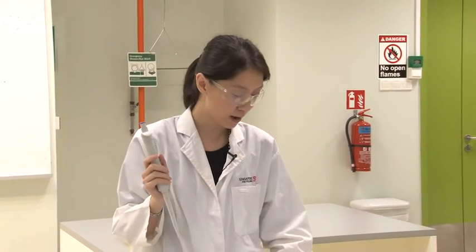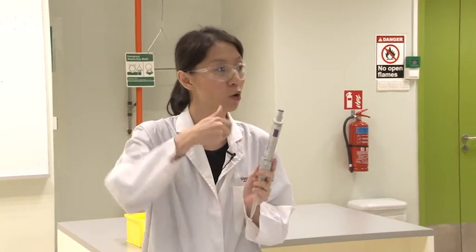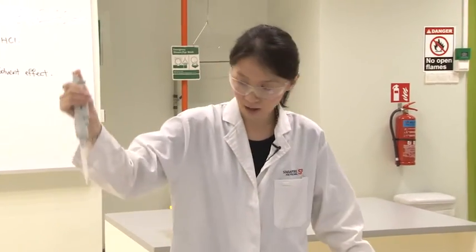So if you are supposed to pipette 3 mL, what should you read? 3,000, okay? So don't overturn the micropipette. So 3,000, you pipette the corresponding reagent.